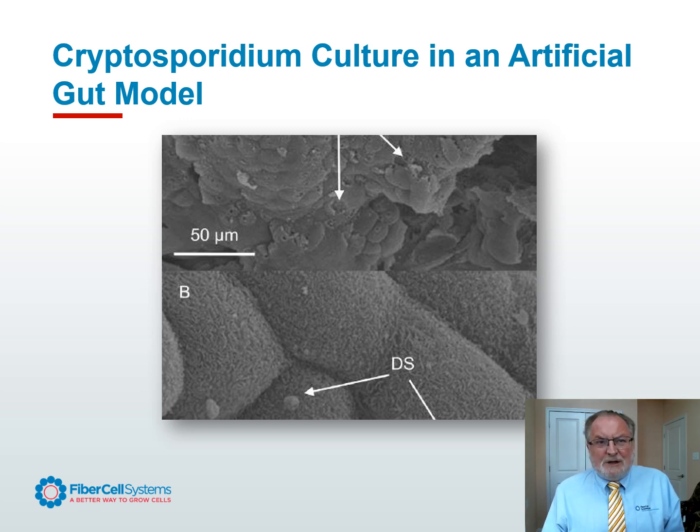Whenever we're looking to generate a new model, we need to look specifically at how the in vivo situation is portrayed, and then just try to recapitulate it in a hollow fiber system. In the gut model, it's an interesting situation because we have a high oxygen side, which is where the circulatory system is, and as it turns out, the inside of the gut is very low oxygen.